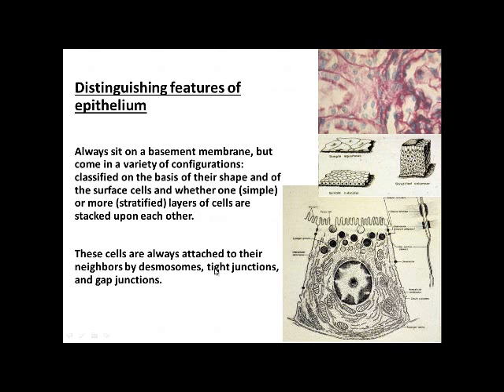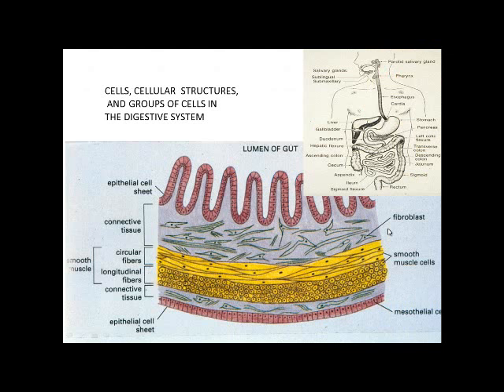The cells are attached to one another by junctions. And here we can see the different junctions, and located usually rather close to the lumen is where you have the maximum number of junctions. And this is a zonula occludens right here, which would occlude things from coming through, and that's how epithelial cells collectively are able to make a cavity, because they have junctions between adjacent cells. And those are not just junctions here, it's actually a junction all the way around the cell, as we'll see in a little bit. Now, in the intestine, we have epithelium on the inside.